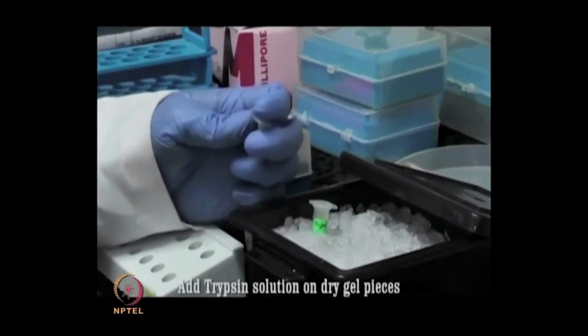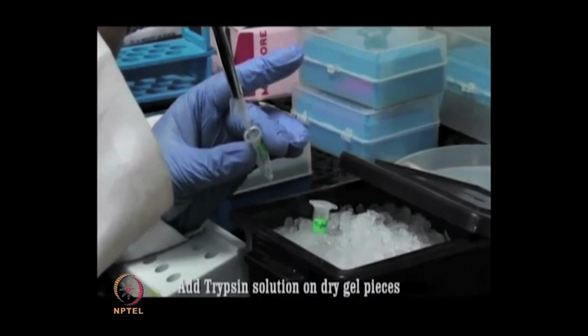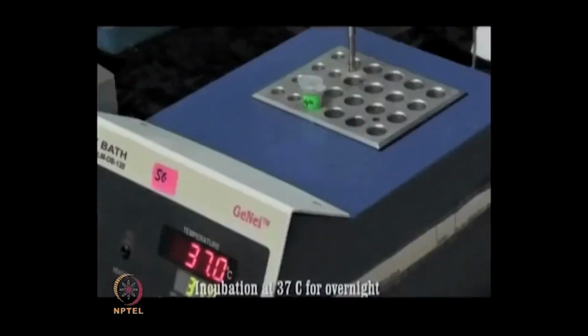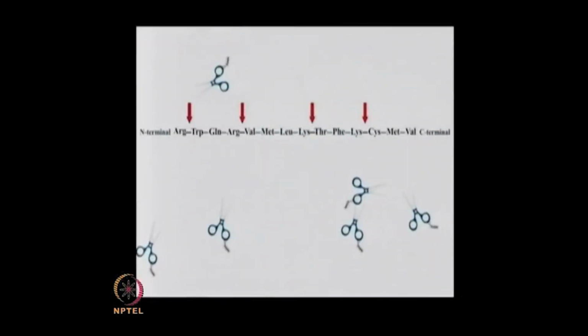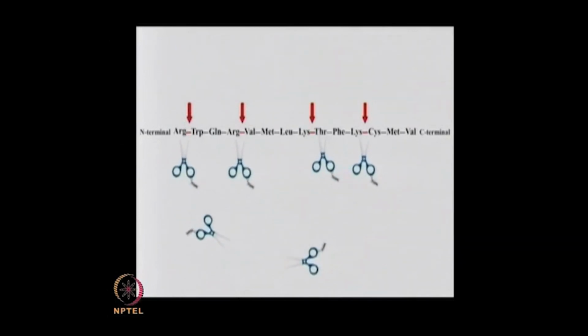So, add trypsin to the dry gel pieces and keep it on ice for 30 minutes for absorption of enzyme by the gel pieces. Add 25 microliter of ammonium bicarbonate buffer. It is the same buffer in which trypsin is prepared. Incubate at 37 degrees for overnight, 12 to 16 hours, for proper proteolytic cleavage.